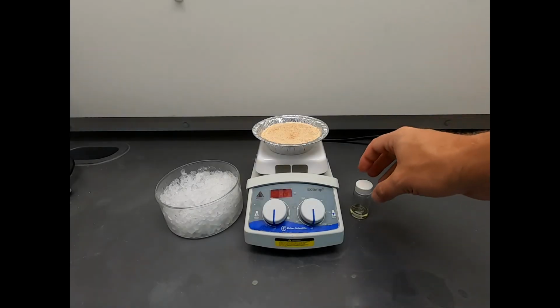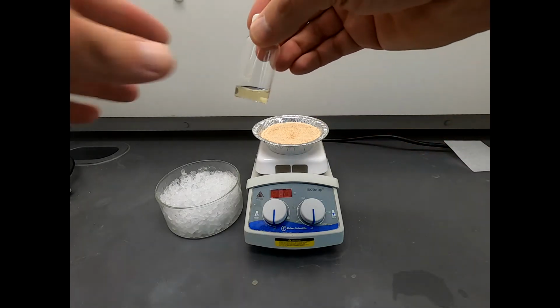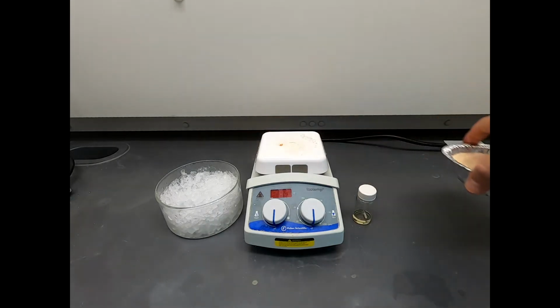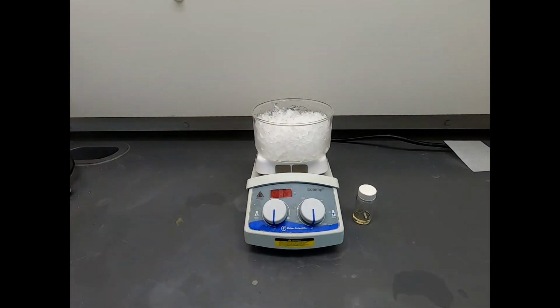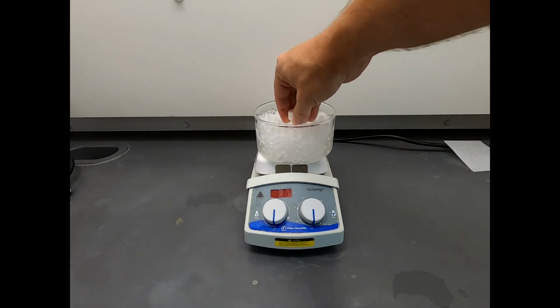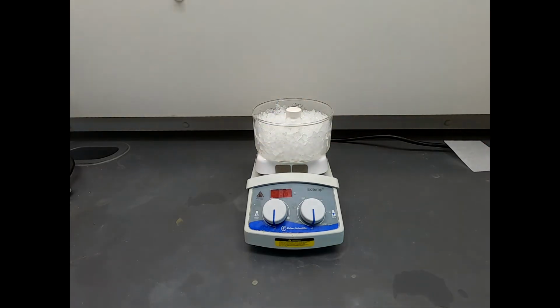The reaction has now, actually, it's certainly cool. It's been allowed to stand overnight, and there's really no change. There's a little sand sticking to the side, but there's no change. So our hot plate is now cool, so let's get rid of the sand bath. And let's put an ice bath on here. And I'm going to sink this down into this ice to the bottom and let that cool a little bit. And once it's cool, we'll go ahead and take some more steps. In theory, this could precipitate out as it cools, but I don't think it's going to happen. So we'll end up adding some water and go through the steps to get this material to precipitate. And then finally, we'll have to filter it.